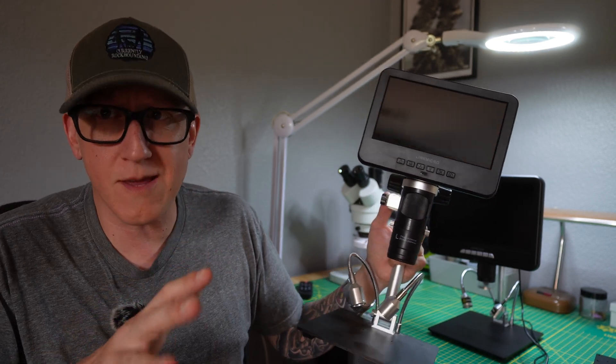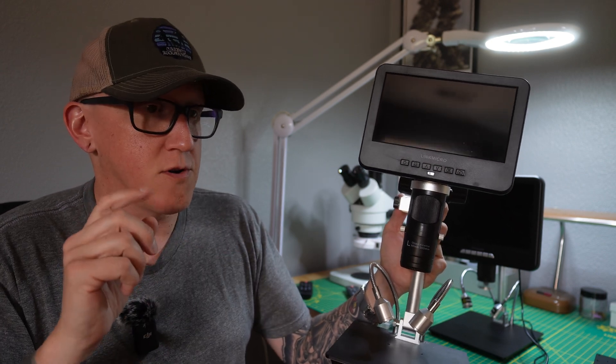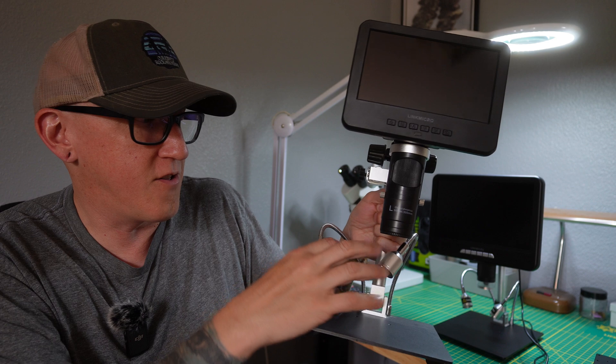I was moderately impressed with it. It is HD, so it's not 4K super high-res. The photos were not great. I got this thing for free, and currently you can buy it for $110 on Amazon. Pretty good deal — I actually use it in the end of my videos a lot. It is good enough to do your basic mineralogical work where you're trying to determine structure of things. You are not going to be taking super impressive photos that you want to share, but from the perspective of dipping your toe in the water and testing it out, this is an excellent value. You get dual gooseneck lights and all of that.